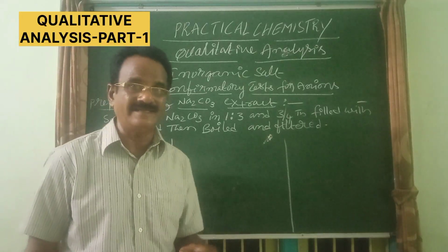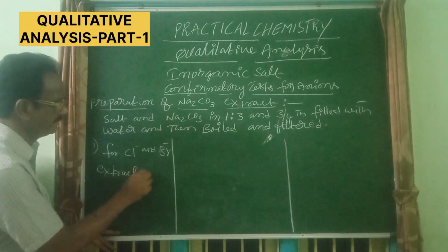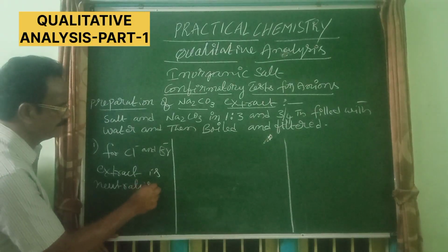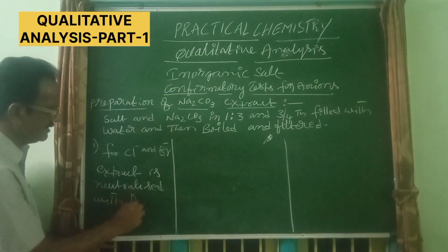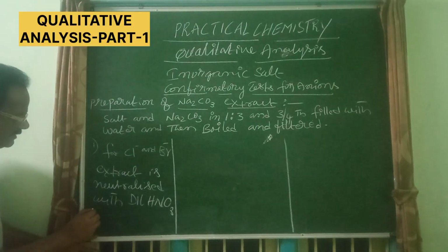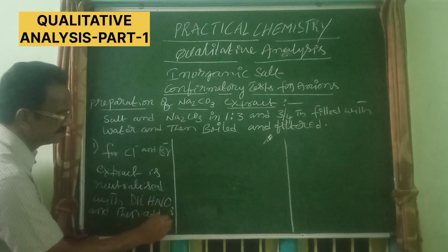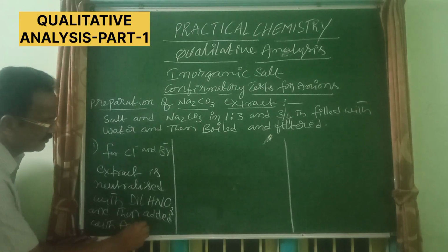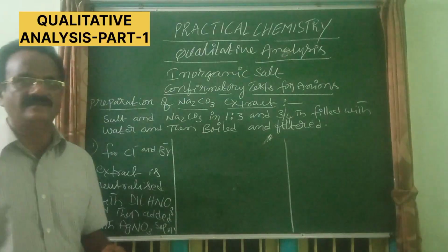Okay, so for this, the extract is neutralized with dilute HNO3 and then added with AgNO3 solution. AgNO3 solution. Is it clear?